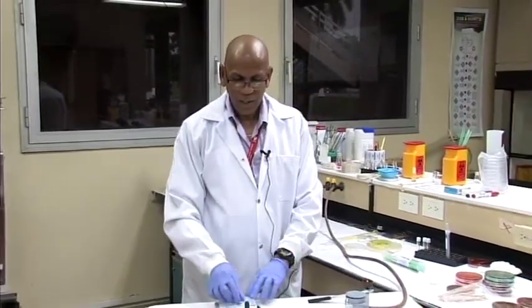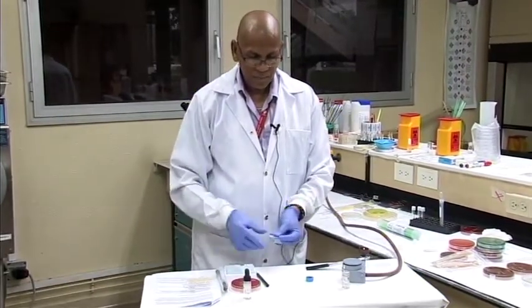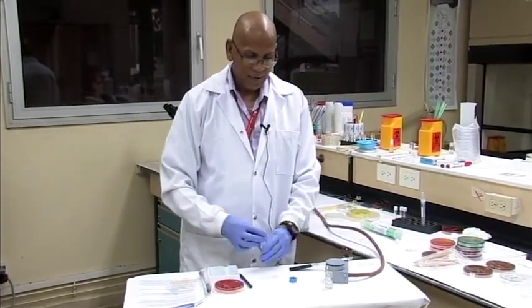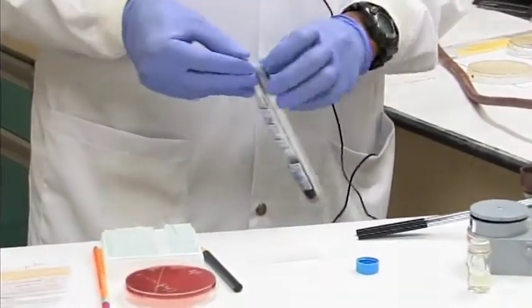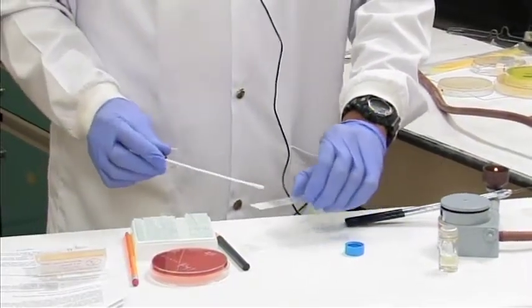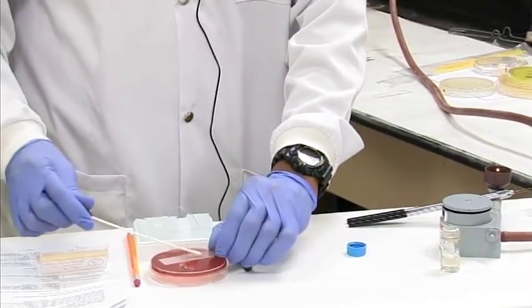Another form of wet preparation involves where you have vaginal swabs and you want to make a wet preparation to look for candida and a parasite called Trichomonas vaginalis. So you'll take a microscope slide, add a drop or two of saline onto the slide, take your sample, which would have come from the patient, and then emulsify your swab on the saline.